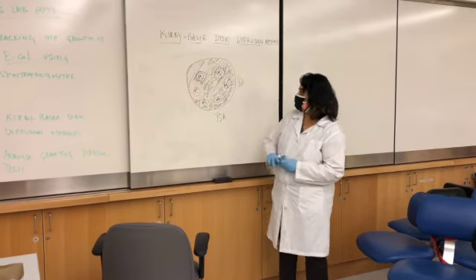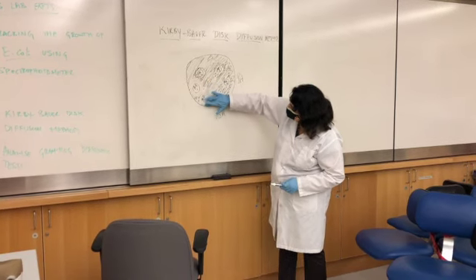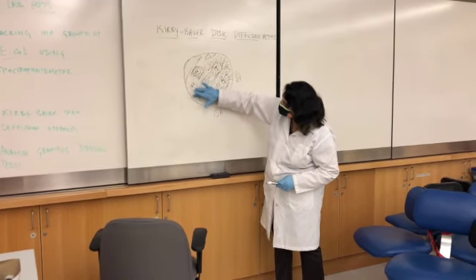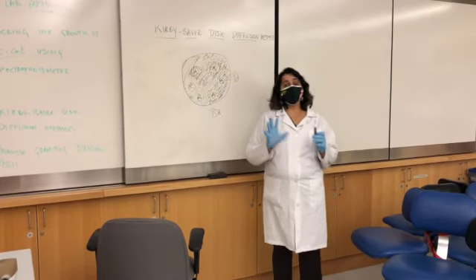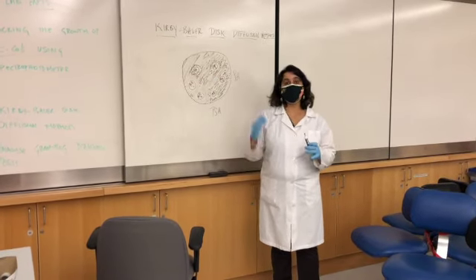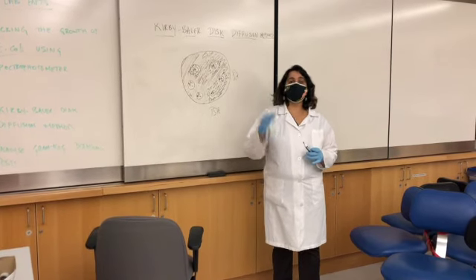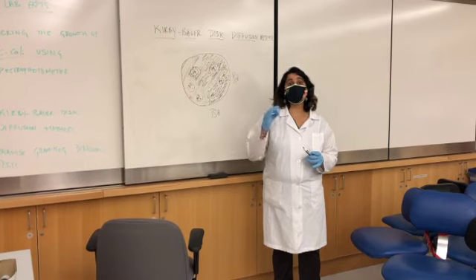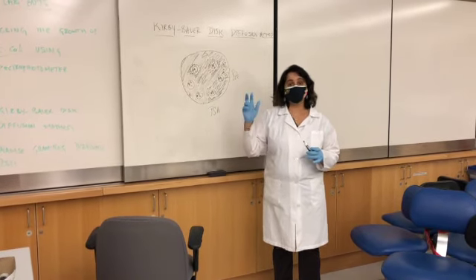Okay? For example, antibiotic 6, if it is very efficient, you will see a very big zone of clearance. So the bigger the zone of clearance is, the better the antibiotic would work against that bacteria. Okay? So you would want to prescribe an antibiotic that the patient's bacterial sample is not resistant to.